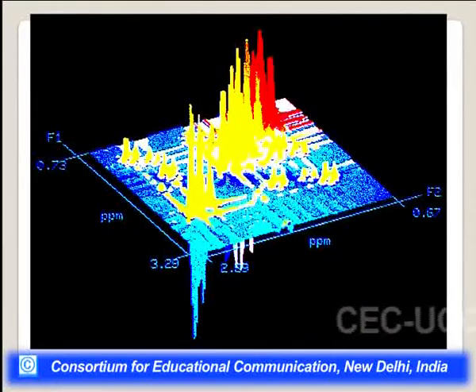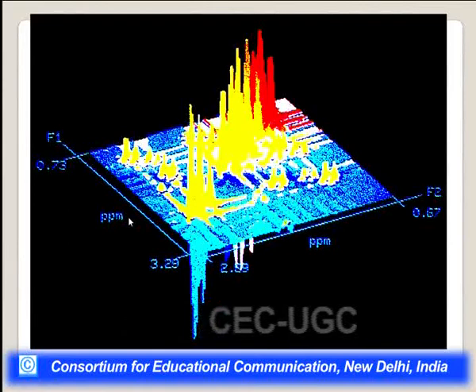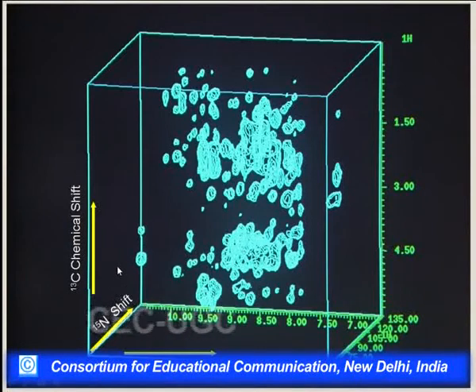And you can see this is the 3-dimensional structure of NMR. This is the delta value, and this shows the intensity of a peak. We are not discussing right now the coupled spectrum of proton NMR and 13C NMR, but you can see what kind of spectrum is observed when proton NMR and 13C NMR are coupled to each other. You can see this kind of dots will be observed for a particular molecule.